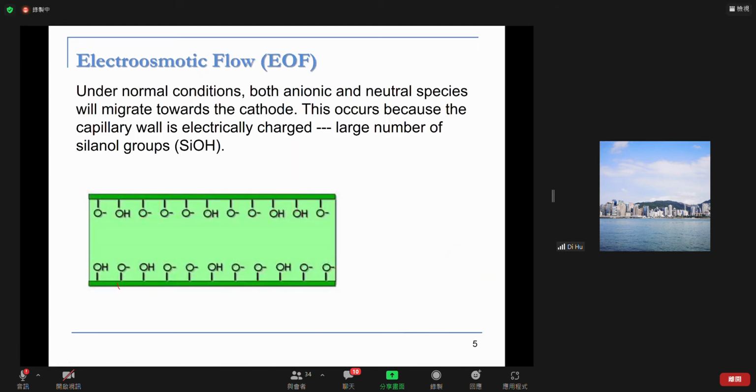Now let's go to the fundamentals. Yes, similar to IC, very good. Let's look at the fundamentals. Why do we have this electro-osmotic flow? How did that happen? You told me that all the ions and neutral compounds go to the destination vial, so I should know what happened.